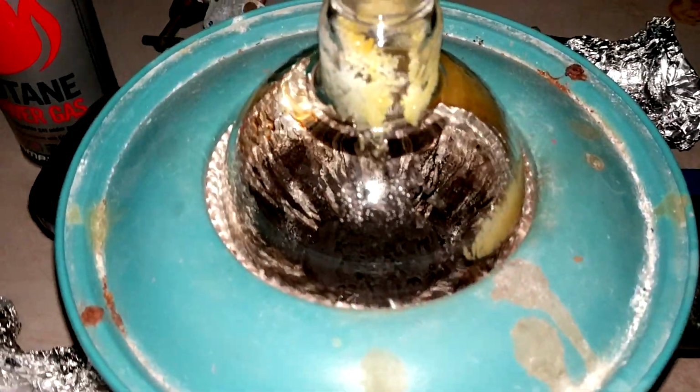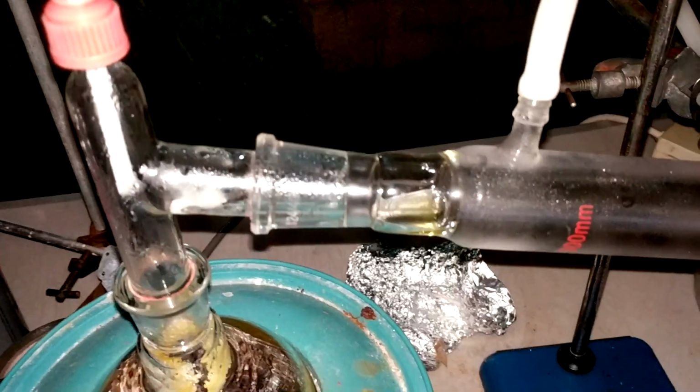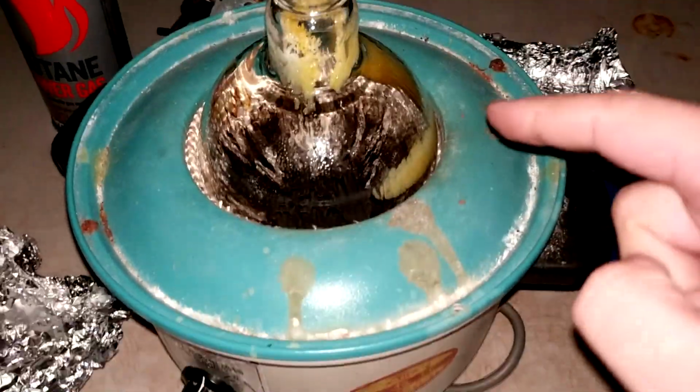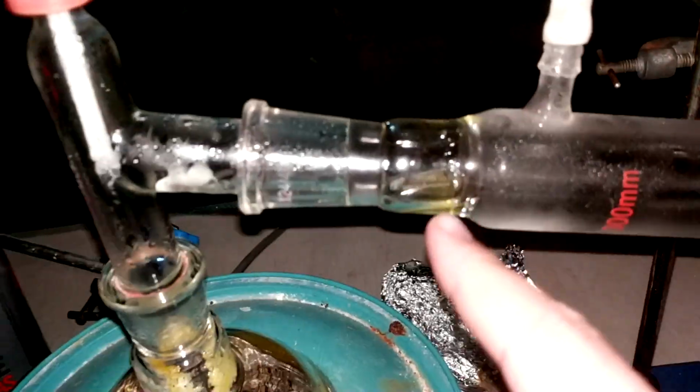Alright, it's definitely done. That little black stuff at the bottom is basically just our catalyst. Unfortunately, it did get a little yellow at the end of it, so I'm fairly sure we overheated it, and it didn't really help with the blowtorching back down. You can see the yellowing caused the yellowing of the liquid coming over there.